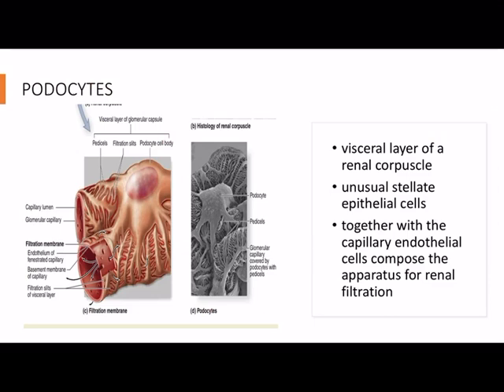So again, the podocytes are the visceral layer of your renal corpuscle. They are unusual stellate epithelial cells that, together with the capillary endothelial cells, compose the apparatus for renal filtration. So here you see your podocytes with your pedicles, your filtration slits, and the podocyte body.